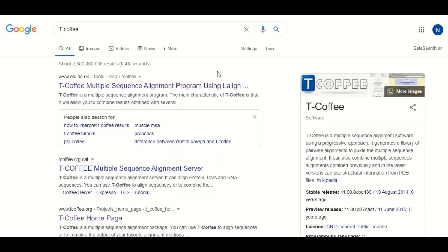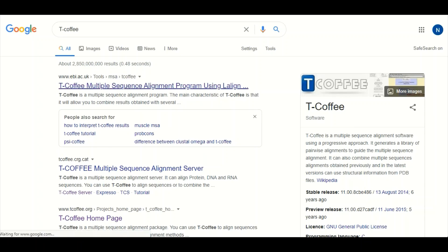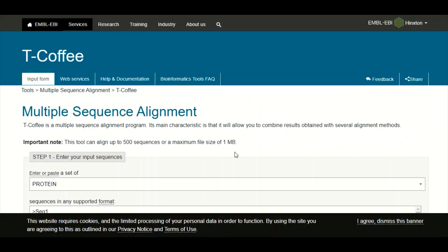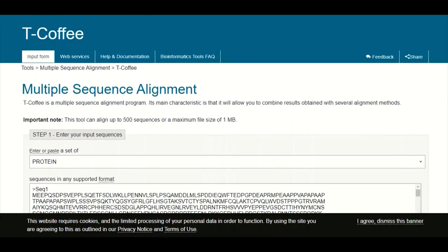Let's first use T-Coffee. There are different versions of T-Coffee available on the internet, but for this tutorial we are going to use the version available on the ebi.ac.uk website. When you click on it, you will move to the next page dedicated to multiple sequence alignment.